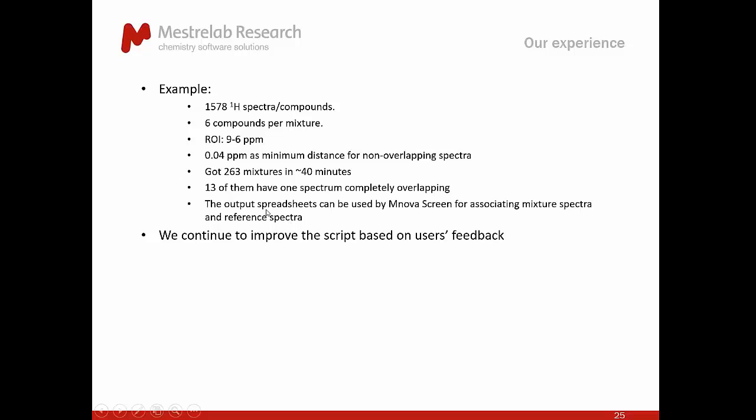Then it outputs spreadsheets that can be used by Mnova Screen later for associating the mixture spectra and the reference spectra during the analysis. Of course, we continue to improve the script based on our users' feedback. We've done that recently and got a lot of improvements. That's the mixture design script.